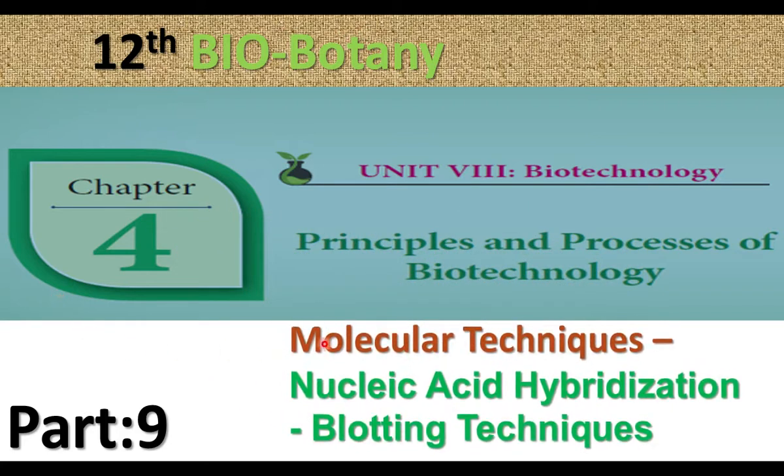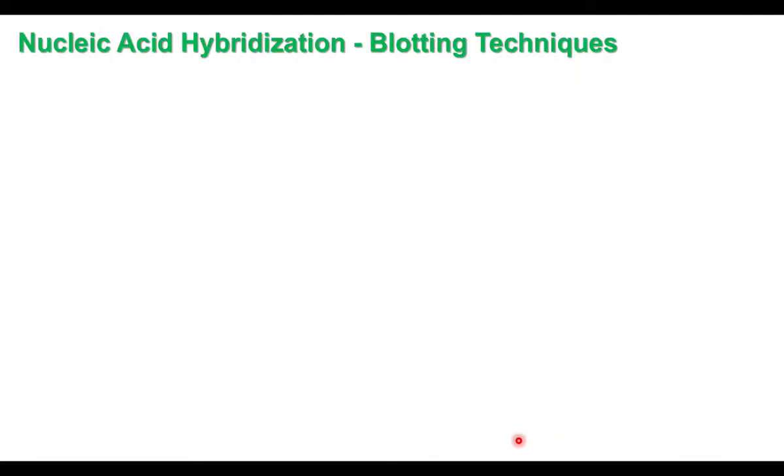Under the heading Molecular Techniques, in the previous video we discussed about gel electrophoresis. In this video we shall discuss about nucleic acid hybridization and blotting techniques. What is blotting? What is the use of blotting?